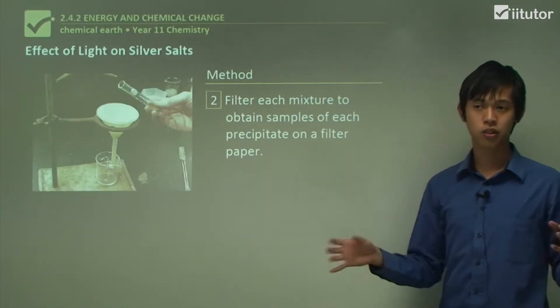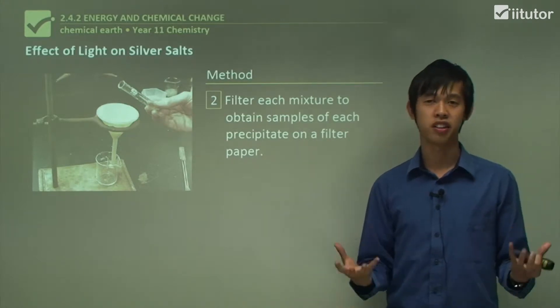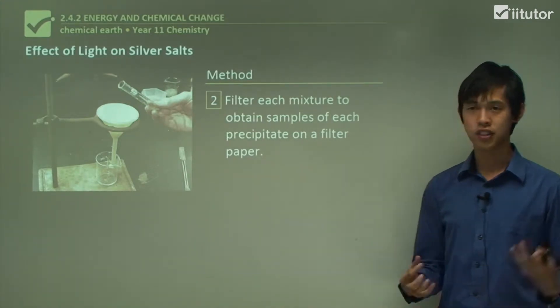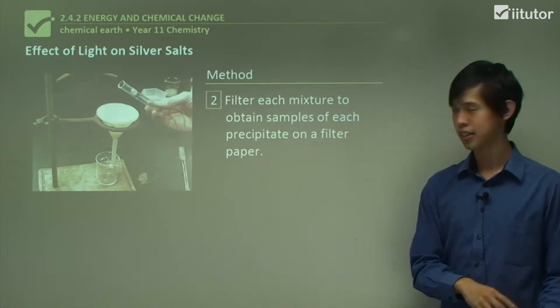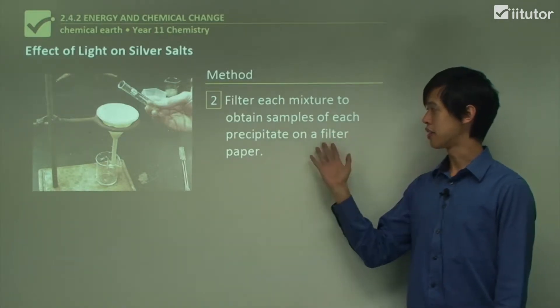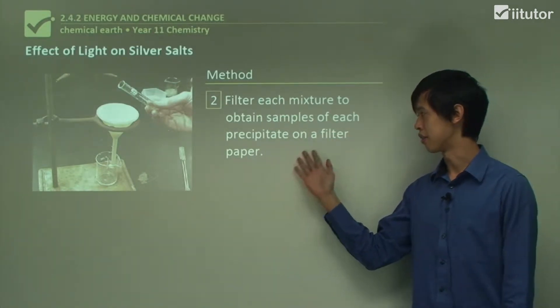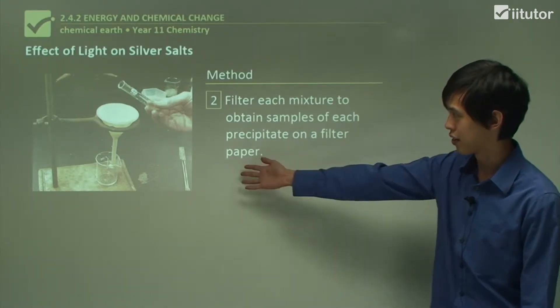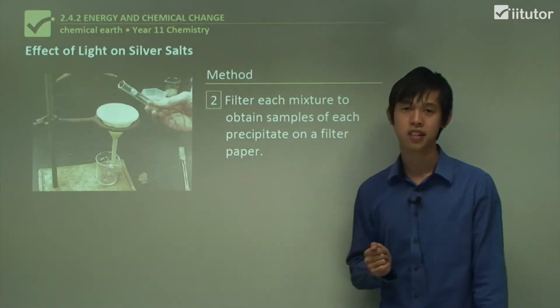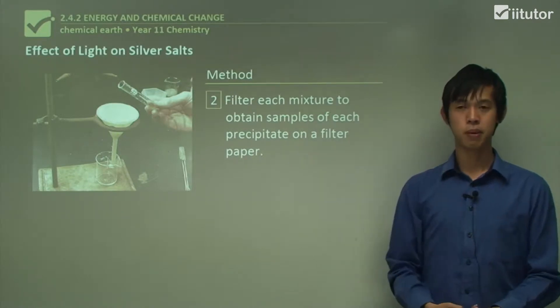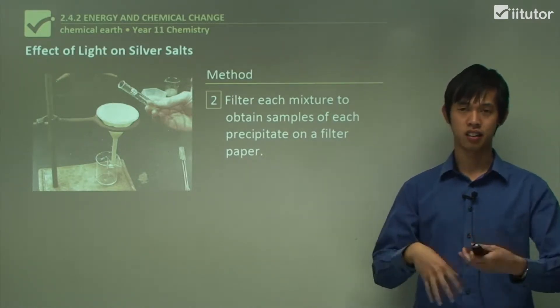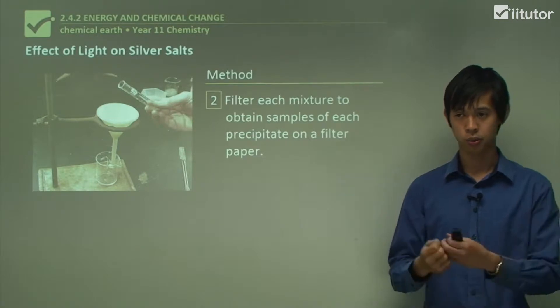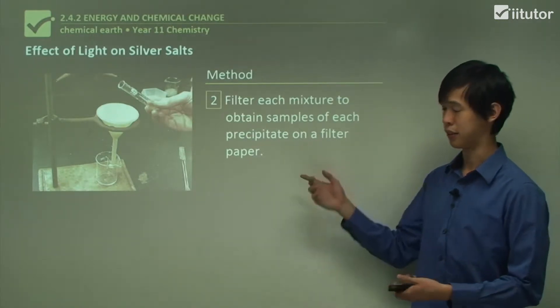Then we take those two solutions we've made — they now have all this precipitate through them. If we want to get the precipitate out, we can filter it. We filter each mixture to obtain samples of each precipitate on filter paper. Just pour it through the filter paper and the silver chloride or silver bromide will be stuck in the filter.